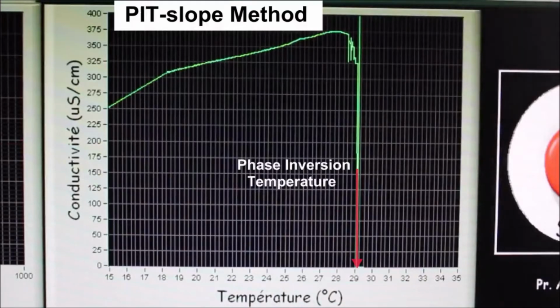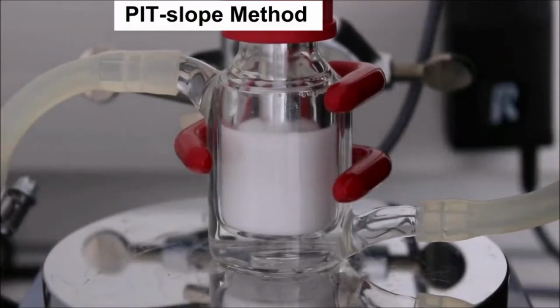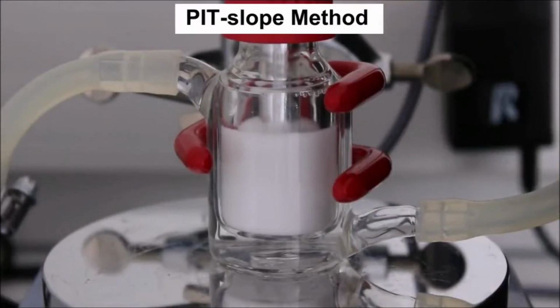Now, let's see the aspect of the emulsion in the experiment. At the beginning, the aspect is white and quite homogeneous, but at a moment the homogeneity is lost and we can see different phases. In fact, since the surfactant has the same affinity for oil and water at the time of the phase inversion, it doesn't stabilize the emulsion. If the stirring is stopped, the phases separate. When the emulsion is reversed and the temperature is already above the PIT, the system will recover the homogeneity.